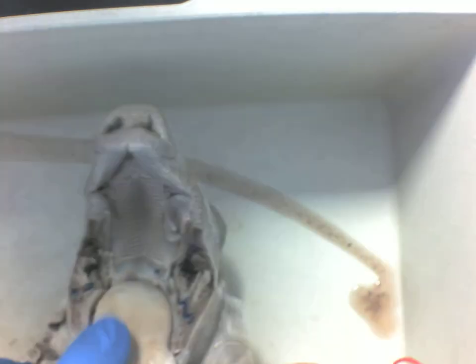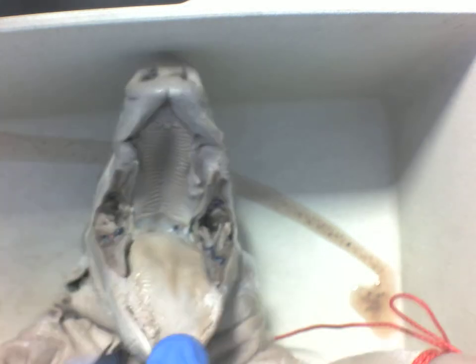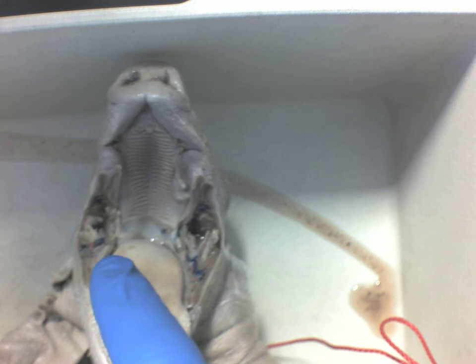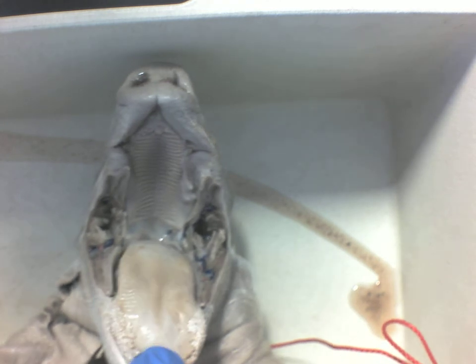Very good. So if you open up the mouth, you'll notice the tongue right here. The tongue is a very strong muscle. It is designed to help food get passed into the next part.